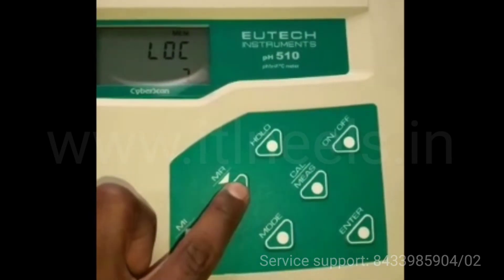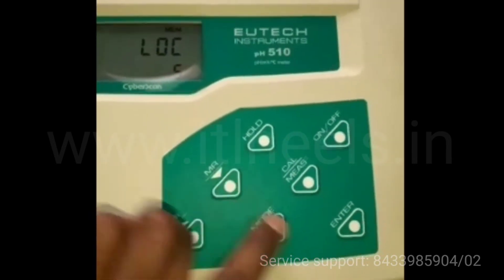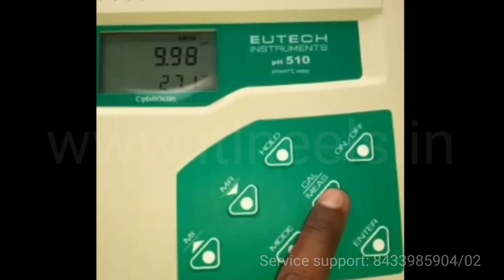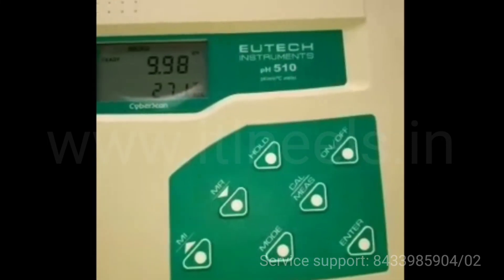You can switch from here to location, and you can press enter to view the data. To come back again to the measurement mode you have to press measurement mode.